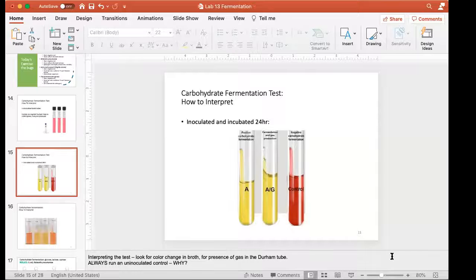All right. Well, if there are no questions for us to talk about, I'm going to go ahead and jump back into our fermentation slides around the place where we were last time. So remember, we're going to look at 3 tests today. We're going to look at what's called the Carbohydrate Fermentation Test. It's a great name because it tells us exactly what it's looking at. We're going to look at a test called MRVP, and we're going to look at the Citrate Fermentation Test.